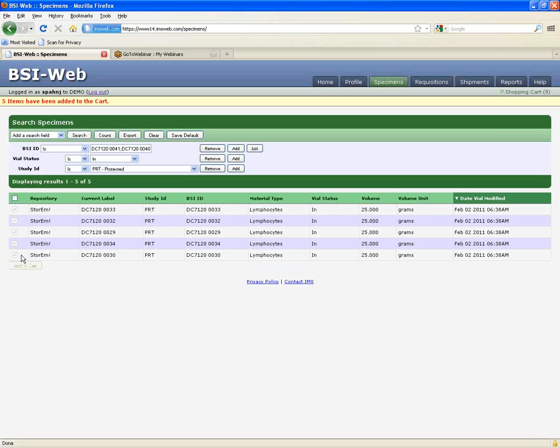So that's BSI Web. I'm going to switch to the client now to show you some new features in locations and requisitions.